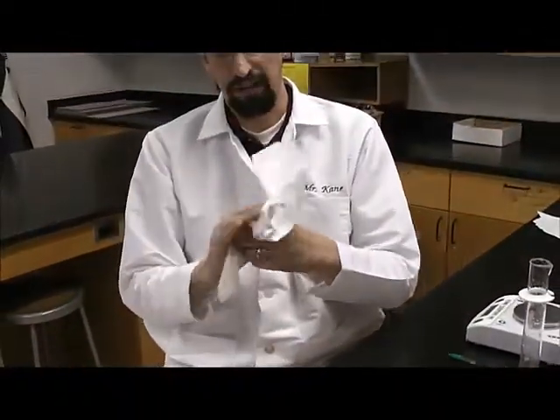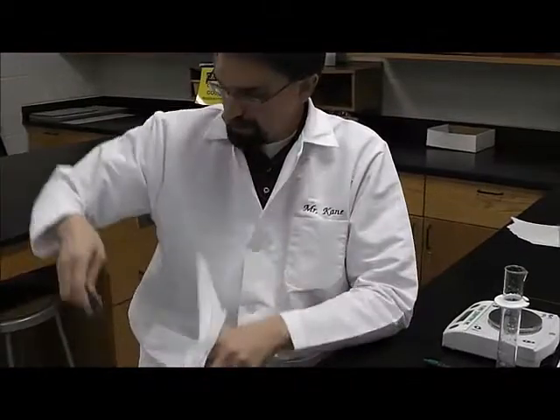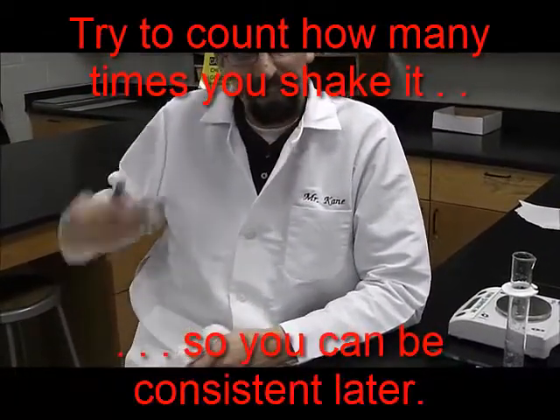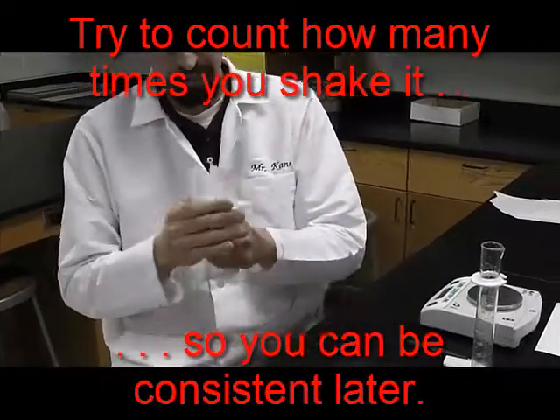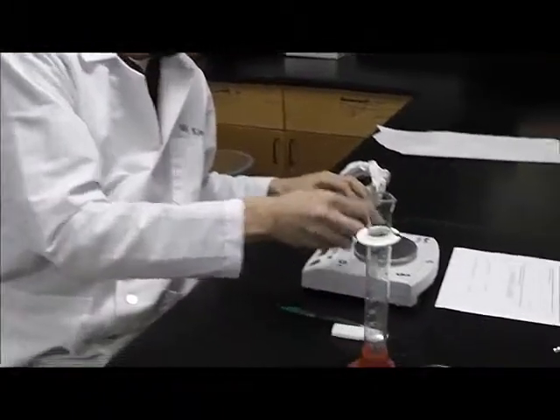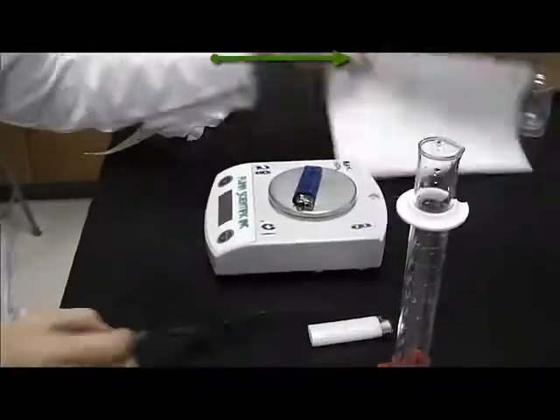You're going to take it out, take some paper towel, and dry it off as well as you can. You're going to shake it to get all the little bits of water out. You might want to count how many times you shake it. That was 8. Then make sure it's dry again. Then you want to weigh it and write that down.